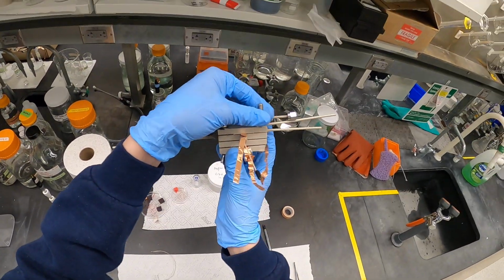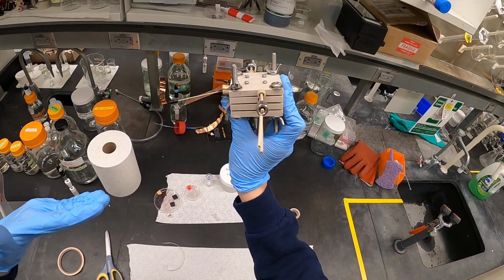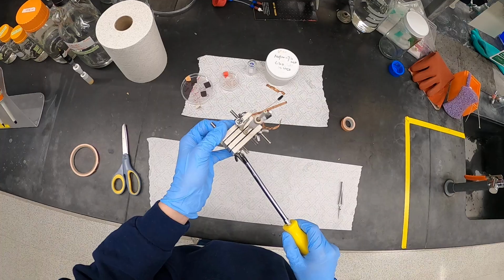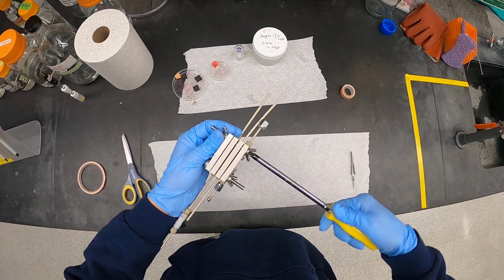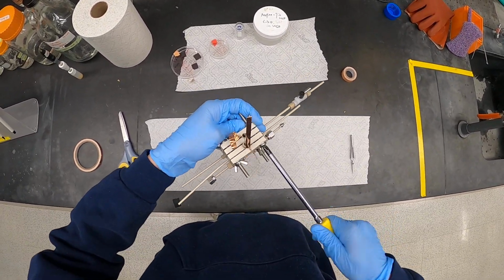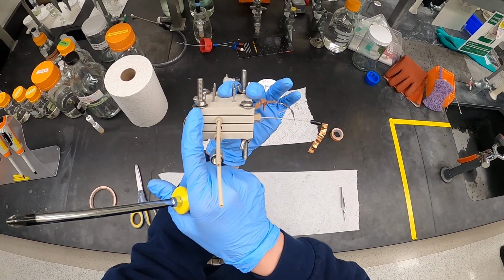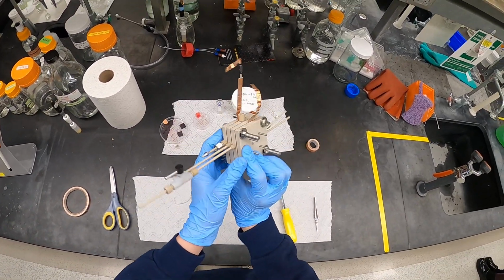Great. And now it might be hard to see on the video, but it's a little bit asymmetric in how much they've been tightened. You can see it's kind of leaning, tilting down and to the left. So I'll just kind of loosen that one maybe, and then tighten the other 3 to try to get it nice and equidistant between those plates. There, that looks pretty good. Doesn't have to be perfect. You can see it's still a little bit leaning toward that end, but as long as you get a nice seal, it's great. And there's our assembled flow cell.